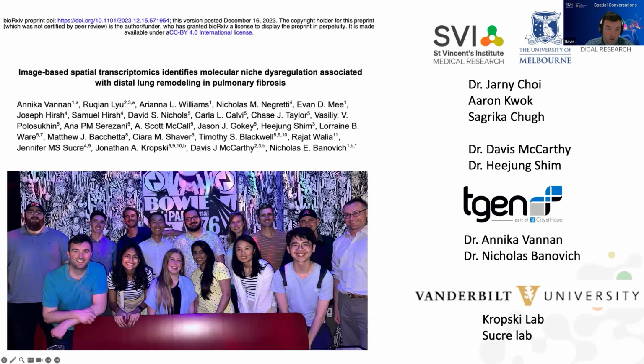More specifically, we have tried Ficture. That does some similar things to what we might do with GraphSage, in the sense that it operates at the single transcript level, and it is more akin to factor analysis type things. So a bit of a different approach computationally compared to GraphSage, but it can achieve some of the same things of finding those transcript-based niches in the same way as we have done with GraphSage.